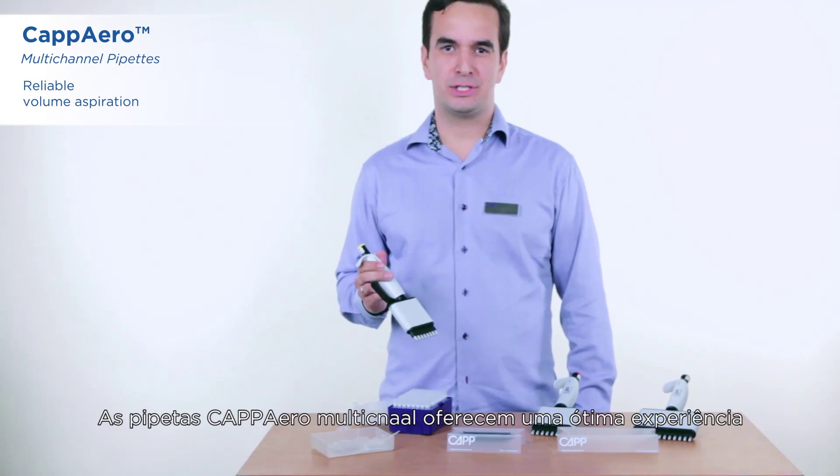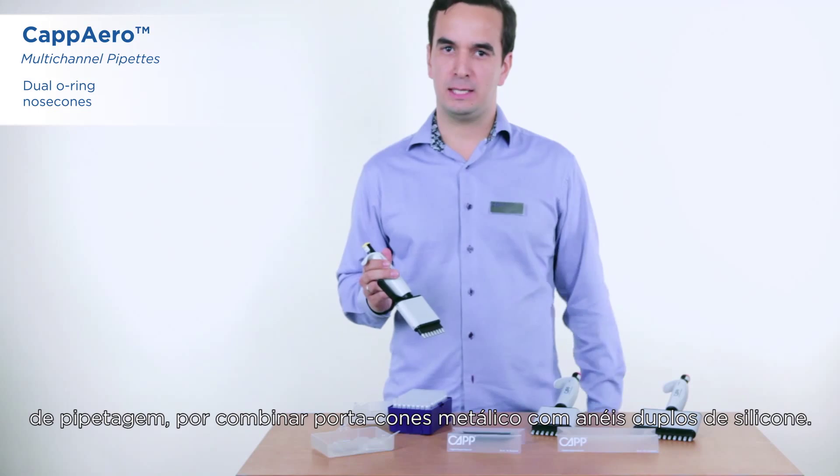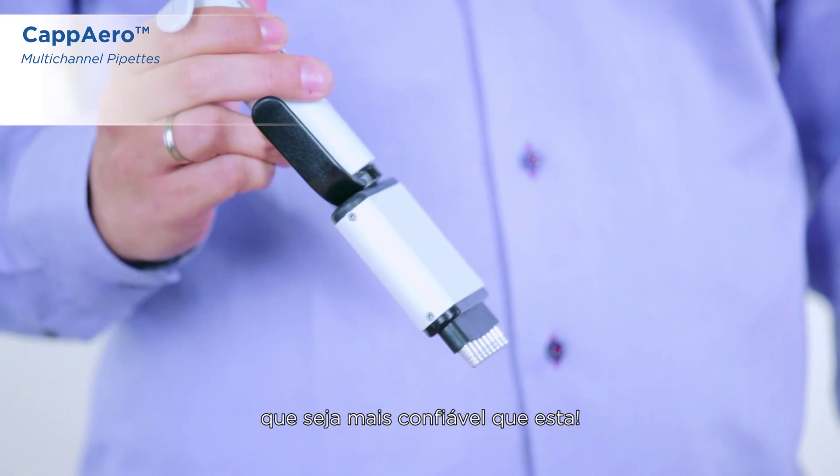The CappAero multichannels offer a great pipetting experience, thanks to our unique metallic shaft with double silicone O-rings. We challenge you to find a multichannel that is more reliable than this one.